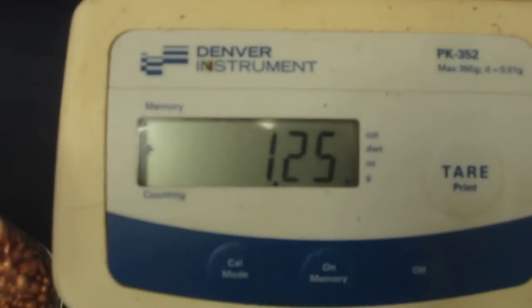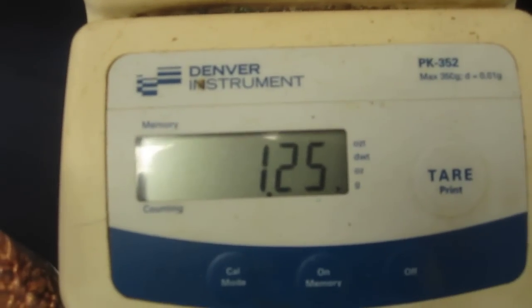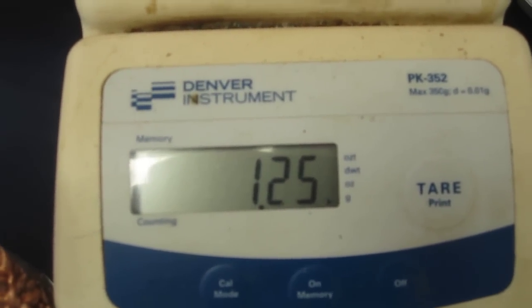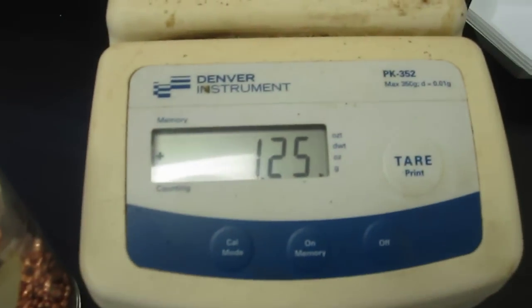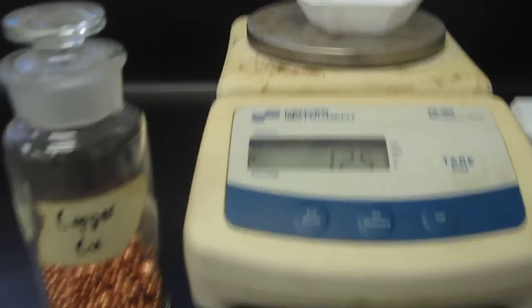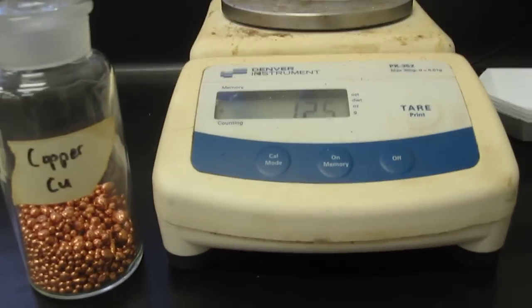That's the mass of them, 1.25 grams, 1.25 grams, which is an inexact number.